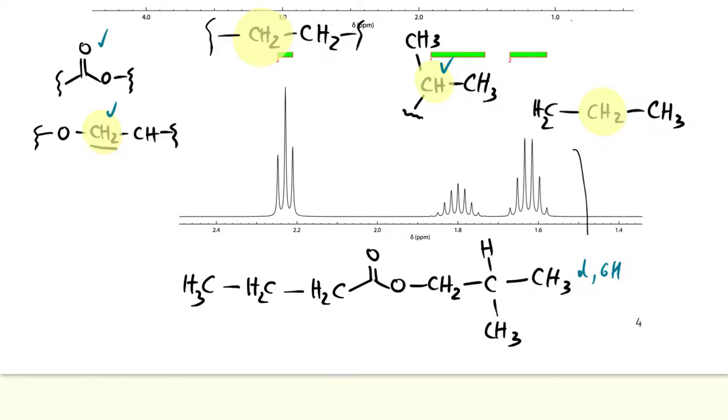Let's move on to another piece of data, because maybe there's a good explanation for it that we didn't see at first glance. Let's try the left-hand side. So our CH2 should be around 2 ppm. That's next door to a carbonyl, usually around 2 ppm. So that's our triplet here. Our sextet is right here, okay? And that should be a triplet. Almost not shifted at all.